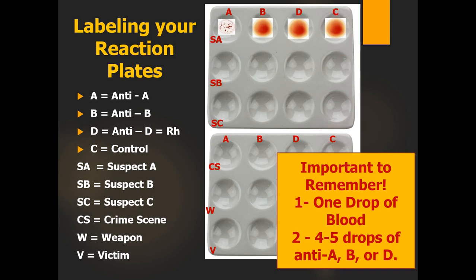Okay, and then we've got a pre-lab that you need to do with your partner before you go back. I'm going to really quickly have you slip over to the crime scene. The forensic technicians have processed the scene and brought back samples from the crime scene. The police department has also obtained blood samples from the suspect. Your job is to determine who could have possibly done the crime so that the expensive DNA testing can be conducted on fewer suspects.